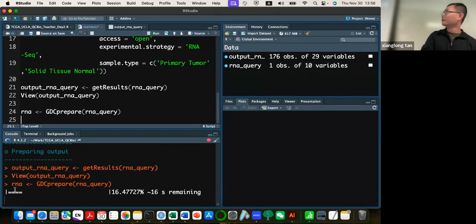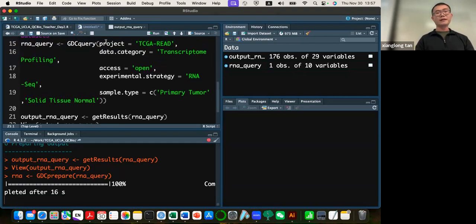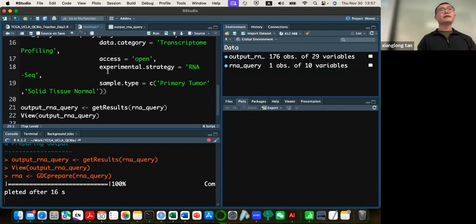And as you all see here, it automatically recognized the location where I downloaded and loaded properly. This is only successful without generating any error if we set exactly the same filter criteria in our RNA query. If we change a file number or something, it pops out an error, like some of the files are missing or something.